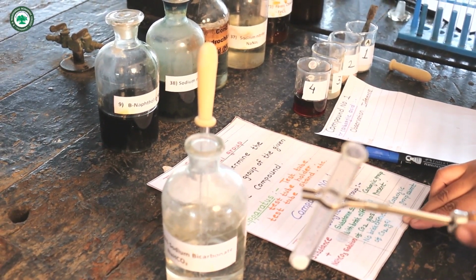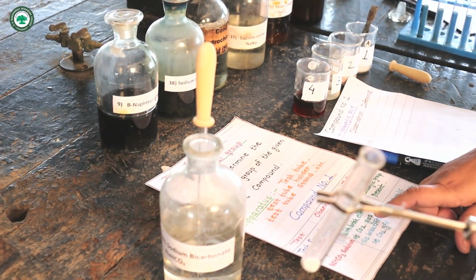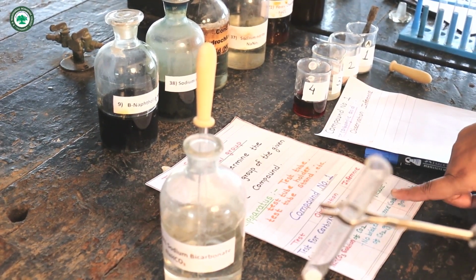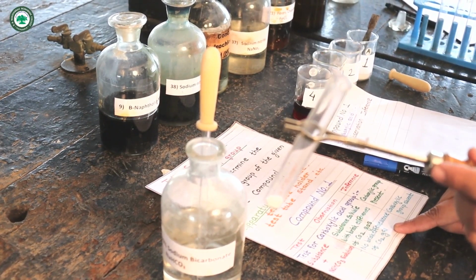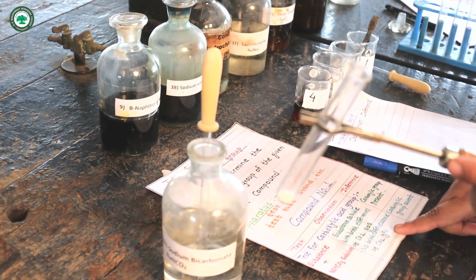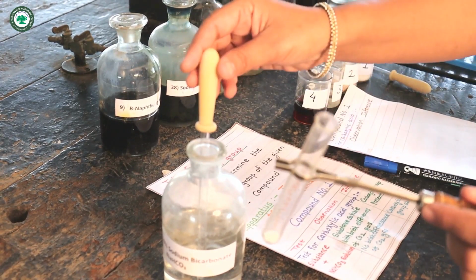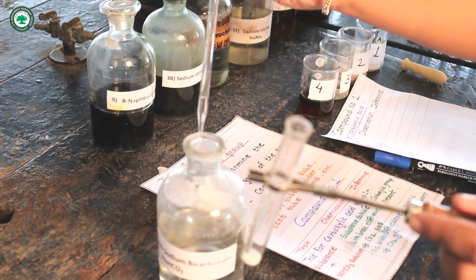Before adding sodium bicarbonate solution, what is the observation? If the substance is soluble with brisk effervescence of CO2, then the carboxylic group is present. If there is no effervescence of CO2 gas, the carboxylic group is absent. Now we add sodium bicarbonate solution to this substance.